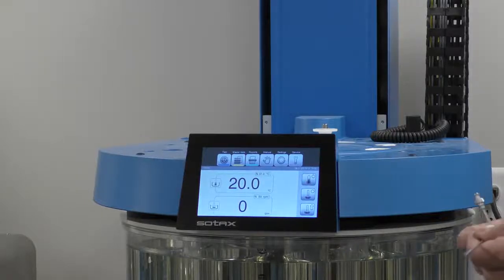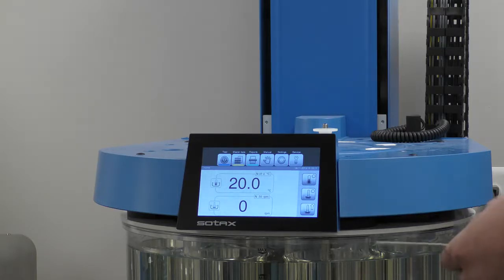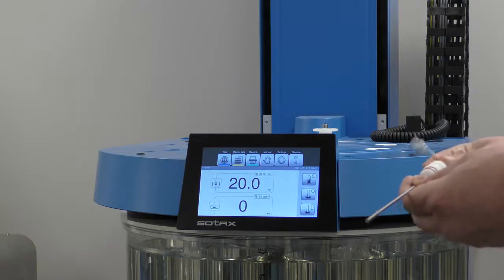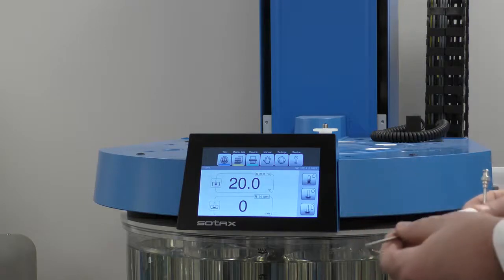Today I'm going to show you how to insert and adjust the CAN 013-ST-5-9 manual sampling cannula on the Sotax AT Extend system. First thing we do is remove it from the package, and you always want to clean it very well to remove any residual debris.